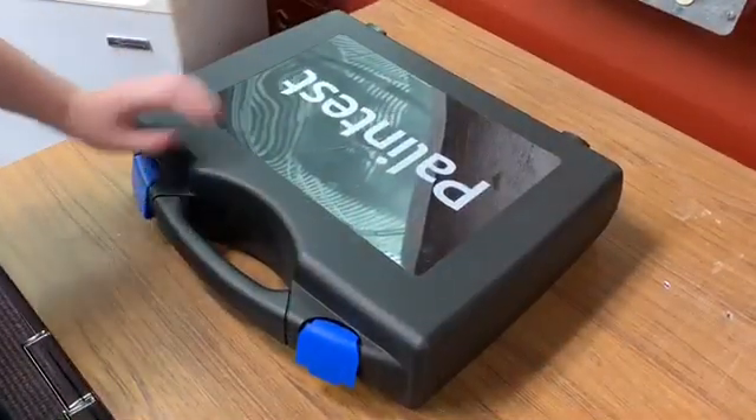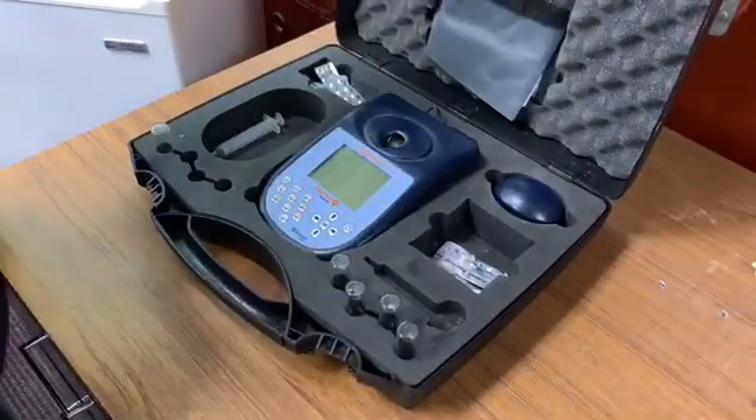This is a Palin Test 9 machine that uses a photometric method to measure our pH and chlorine values. We will have to perform this test at the top of every hour. This is our Palin test box and inside you will see we have four tubes.